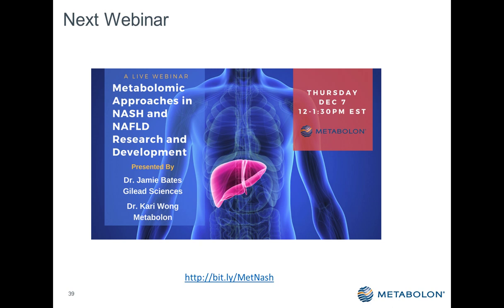So much so that one of the things I'm thinking about doing as an R&D project for this coming year is a fingerprinting technology where we simply take the sample and analyze it very quickly through direct injection into the mass spectrometer. And again, all we'll be measuring in that case is relative changes between case and control rather than giving a scan of every compound that we can detect. Those sorts of things are useful, I think, in triaging samples to determine which things you're particularly interested in, either for deciding to go down the road of doing a full untargeted metabolomic screen or for targeted assay work.